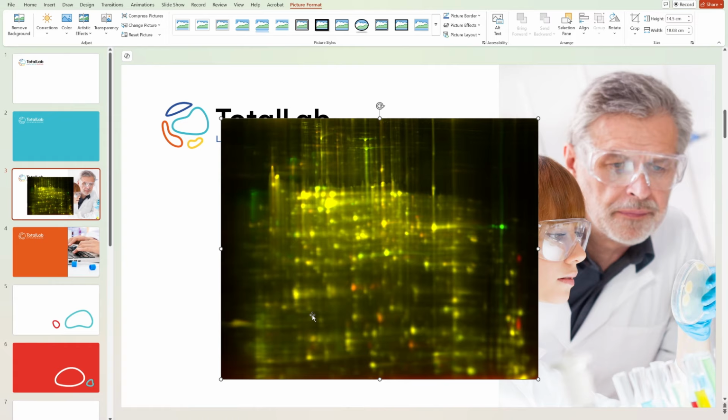So what you can quickly gather from this image, if you're doing work for a customer, for a client, or just for internals, is where spots are missing or are present or absent. And this lines up, or should line up, with the coverage score that you get and then you present. So this is a really quick visual way to say, hey, look, that 80% coverage score that I had looks about right, because I'd say about 80% of these spots are some degree of yellow within this image. But there are some obvious outliers, so I wouldn't expect it to be 99%. So it's a really quick visual check. It's really good to include in LIMS systems and reporting functions. And it's one of the functions that makes SpotMap the industry choice for doing this kind of work, to have this quick data view.